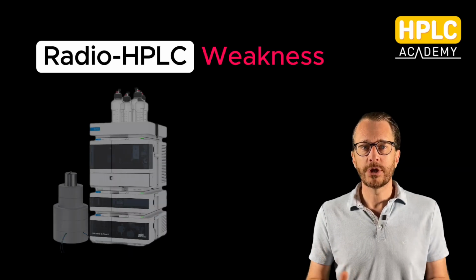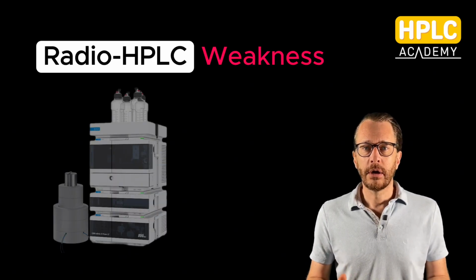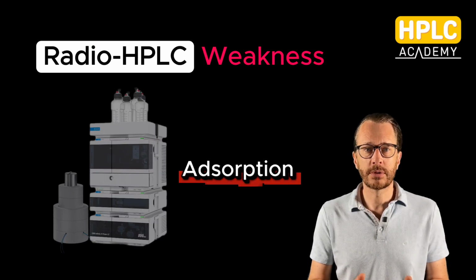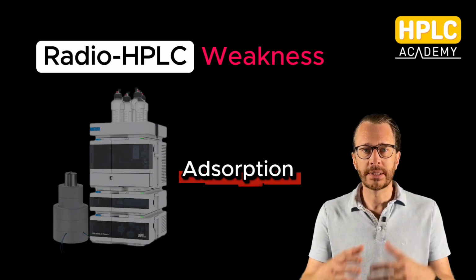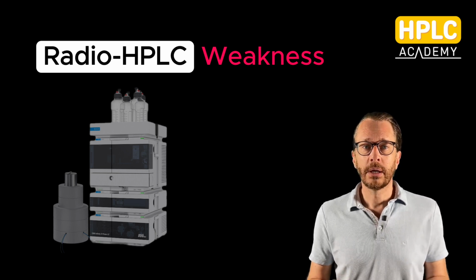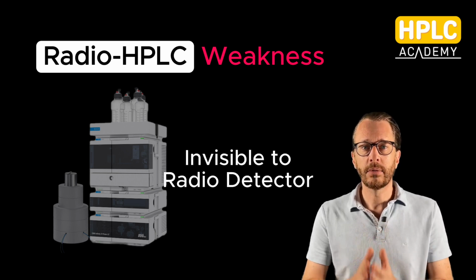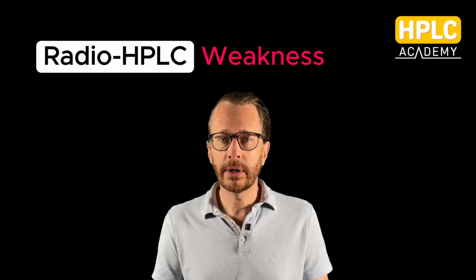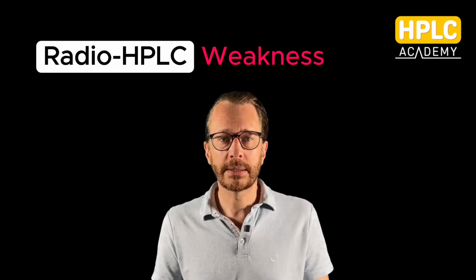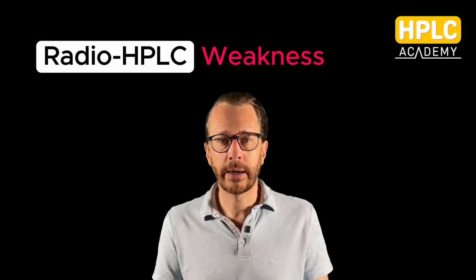However, radio-HPLC has a known weakness here. Free radionuclides and highly polar species often adsorb strongly to the HPLC column, the system, the tubing or the injector, and simply do not elute. They are invisible to the radiochromatograph. If you rely only on radio-HPLC to detect free radionuclide, you may miss it entirely and report a falsely high RCP.